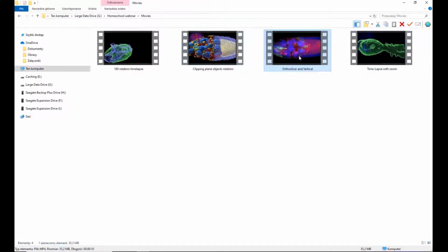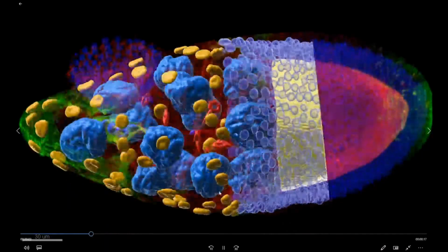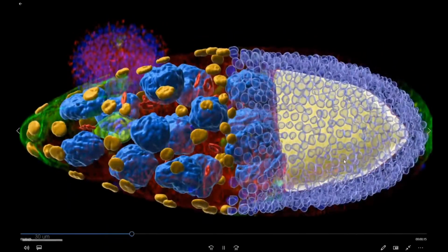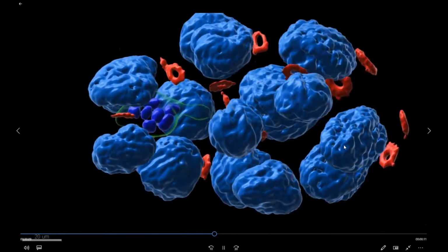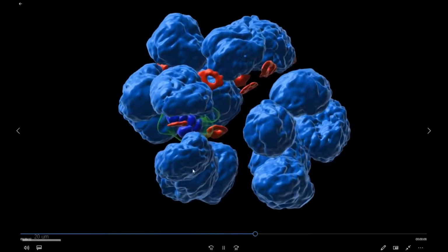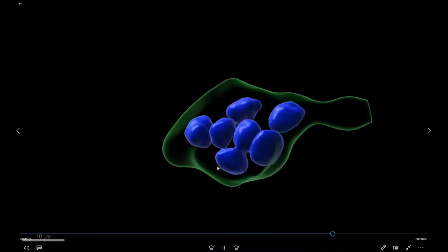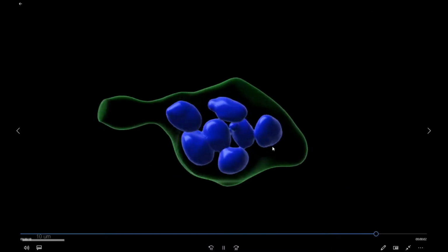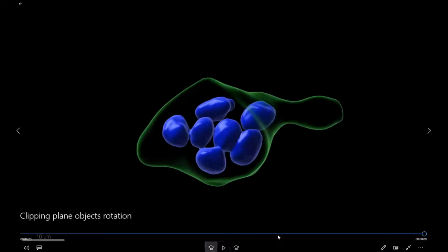So that was easy. Next, the objects come into play. So we can see that the objects appear during the rotation, then they disappear. I'm rotating, freely zooming in and zooming out, and the video is ended by the slight rotation around this object.